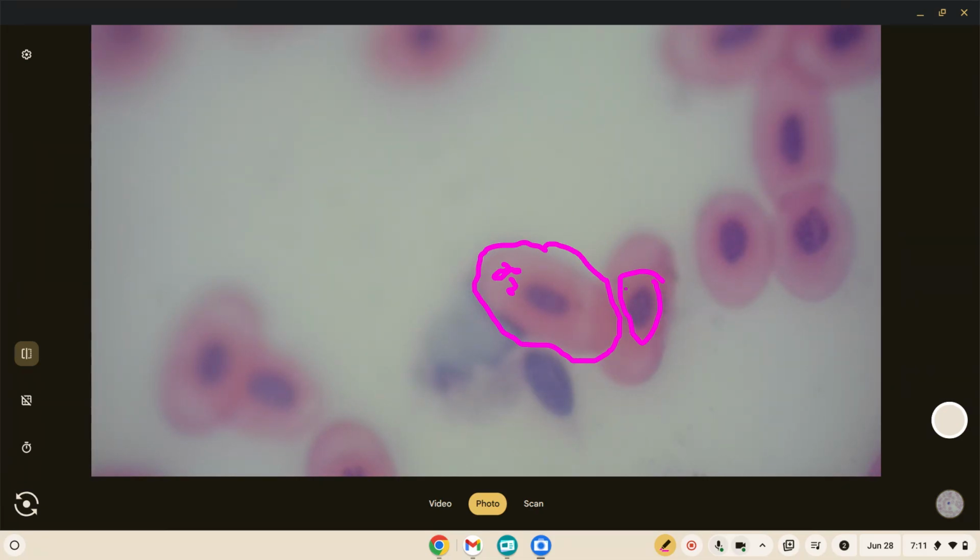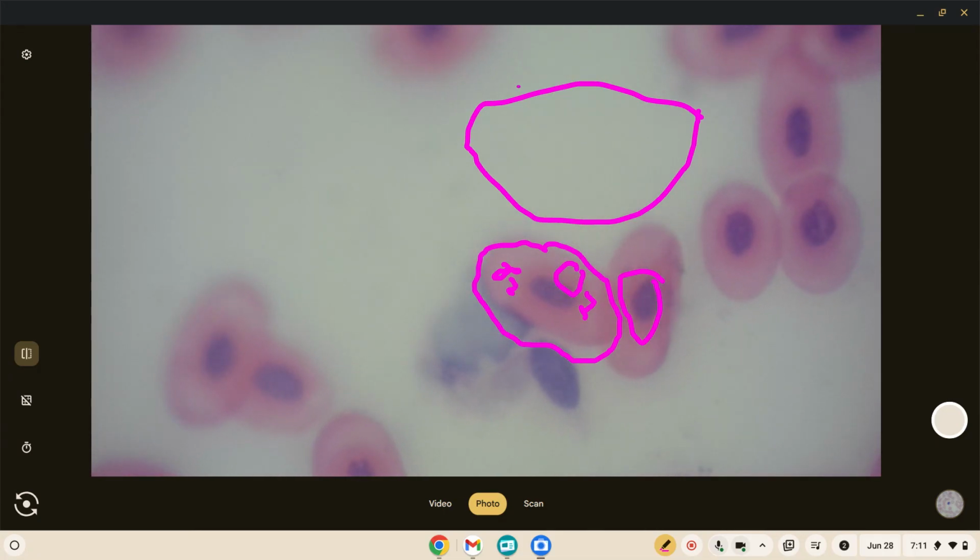And ours are smaller but have no nucleus, so they can carry lots of oxygen to the other cells in our body. And the reason there are a lot more open spaces is because the frog cells are just so much bigger than our cells. Even with the nucleus, they can hold more oxygen than our cells can, even without the nucleus, so they don't need as many blood cells.